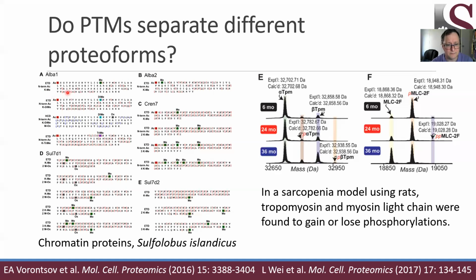So in this first case, we see an acetylation appearing in all cases at the N-terminus, but we see that this lysine showing up on the first row shows up with a methylation in this proteoform, a dimethylation in this proteoform, sometimes with a dimethylation and an oxidation. Now, I note that we can't really tell in most cases whether an oxidation happened in vivo or happened when we were working with a sample on the bench.